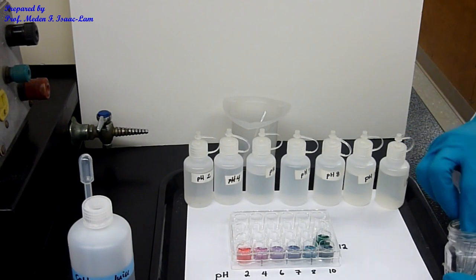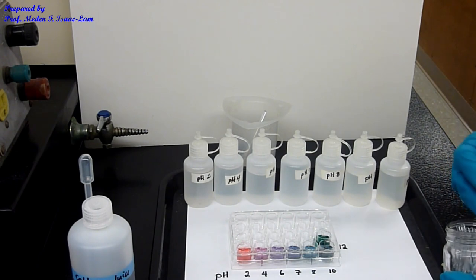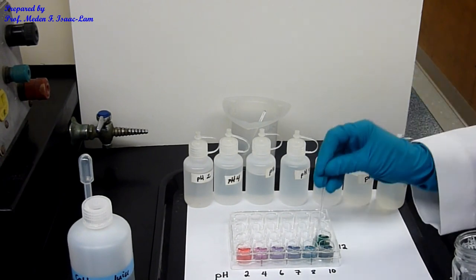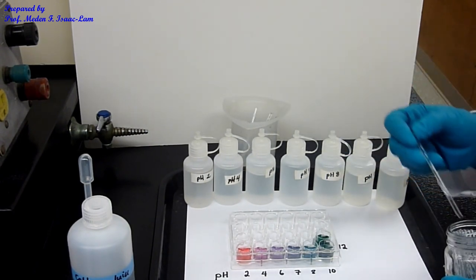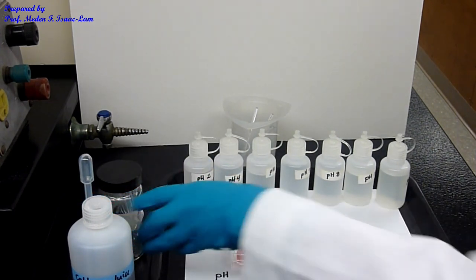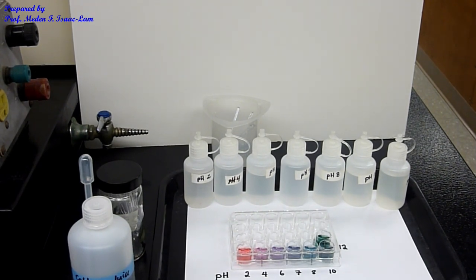Now write down the color of each of the solutions, according to the pH. You have a range of colors. What this means is that the indicator is sensitive to the pH. We're going to save the solutions for part B. Now you determine which samples are acidic, neutral, and basic.